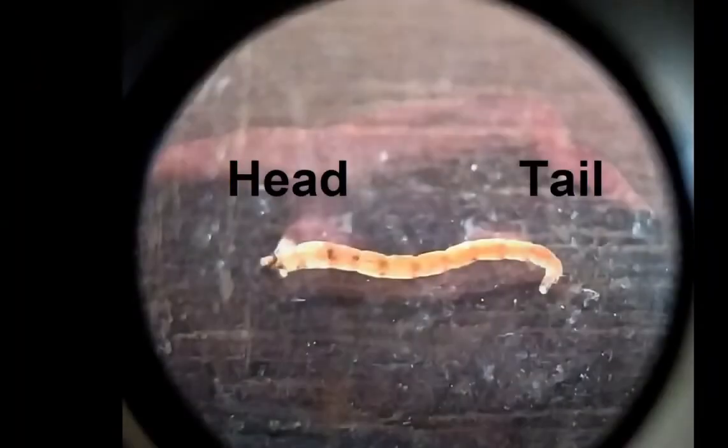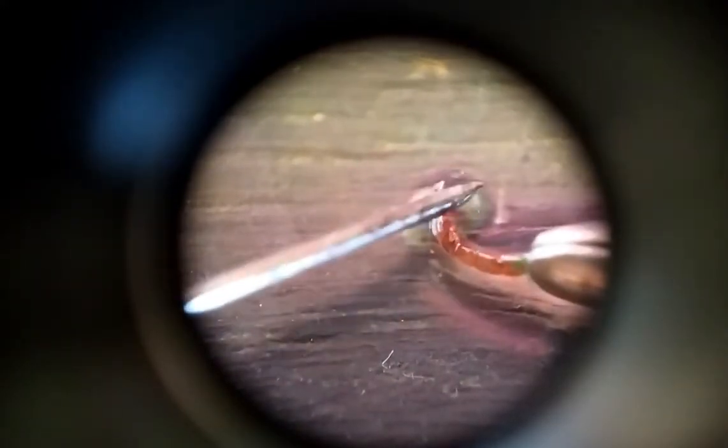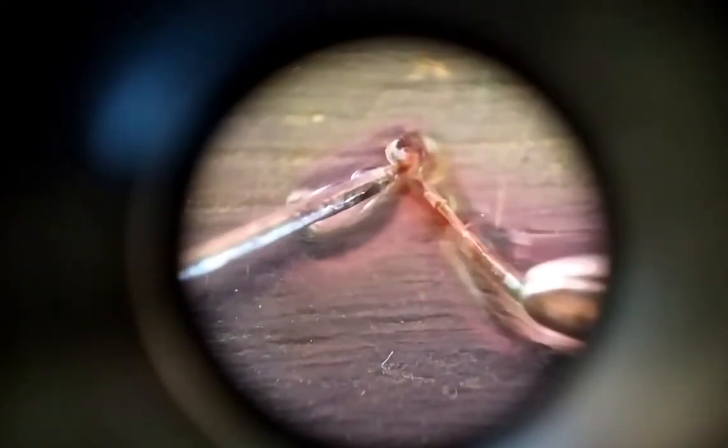An individual larva is placed on a glass slide in a drop of water. Aided by a magnifying lens or a dissecting microscope, locate and distinguish the bulbous head part from the pointed end of the tail. Using a pin or a tweezer, hold the larva in position in the middle. Using a second pin or tweezer, gently pull the head away from the thorax.